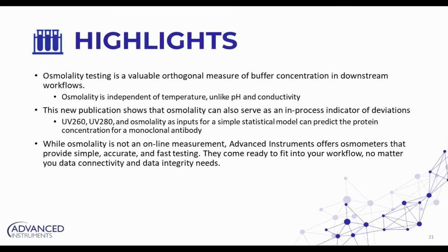So really, just to wrap up everything that we've discussed today, osmolality testing is definitely a valuable orthogonal tool as far as measuring buffer concentration within downstream workflows. So this means more than just that buffer QC measurement. And as Dr. Jungbauer explained, because it's independent of temperature, it's something that really becomes a valuable tool within bioprocessing. And when we speak to purification in particular, you're measuring those buffers throughout this process. It's an in-process test, not necessarily just a check it and leave it type of test.